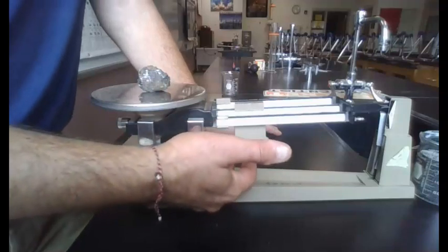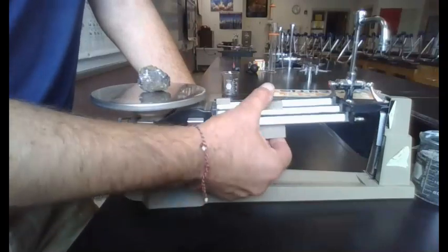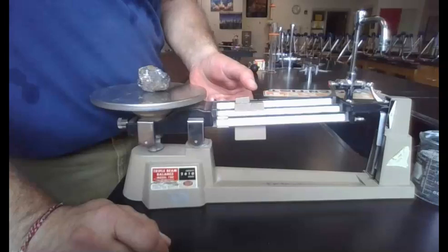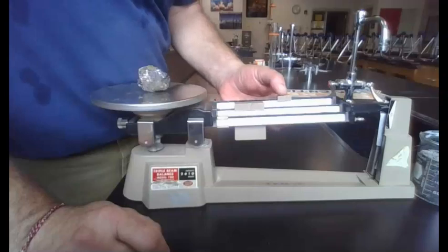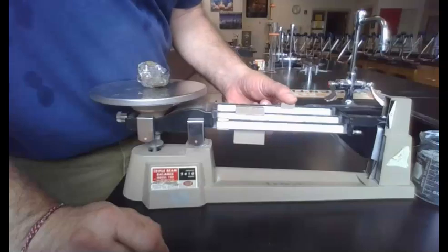Now 100 doesn't tip it. 200 is too much. So you go to too much, and then you go back 1. Then you go to the next highest weight. Nope, 10, 20. Make sure it's sitting on the notch. 30, 40, 50, 60, 70 is 1 too much. So let's go back to 60.